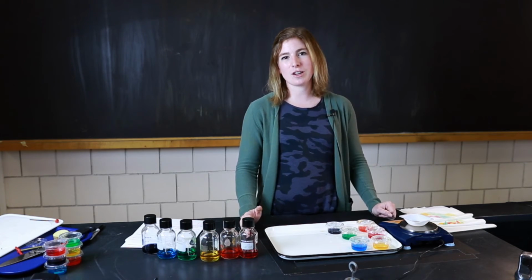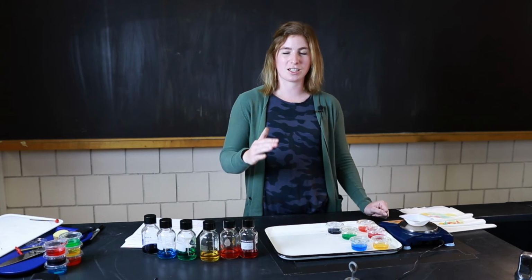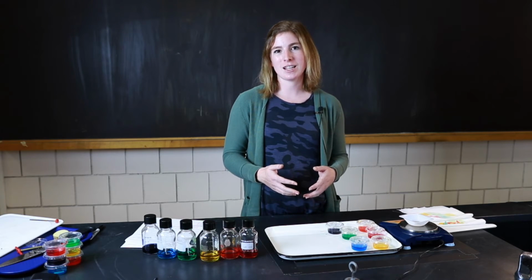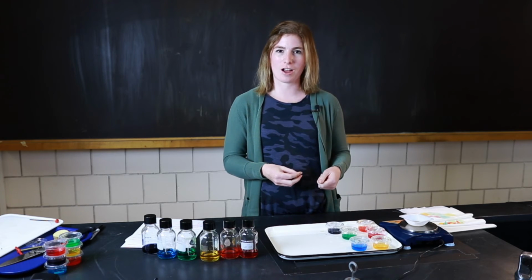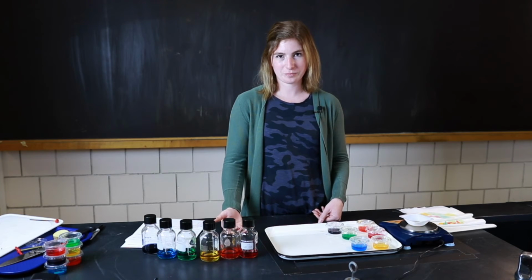You're then going to be figuring out the percent mass difference. The percent mass helps us to kind of calibrate all 6 of our potato samples to one another, because they didn't all start at the exact same mass. So we don't really care about the raw mass that they gained or lost. We care about what was the change in the percentage. This helps us to actually be able to compare them to one another.